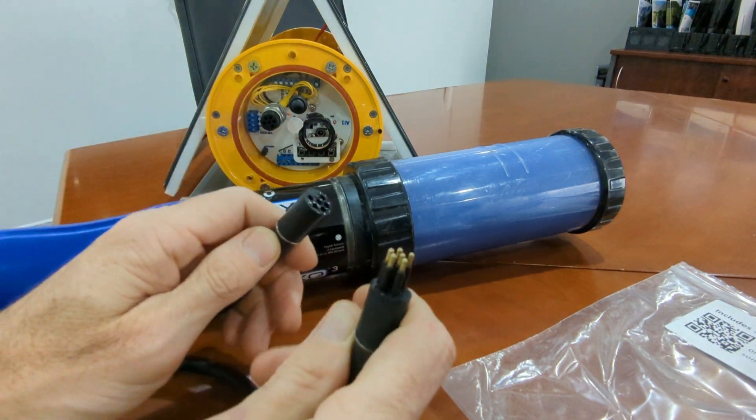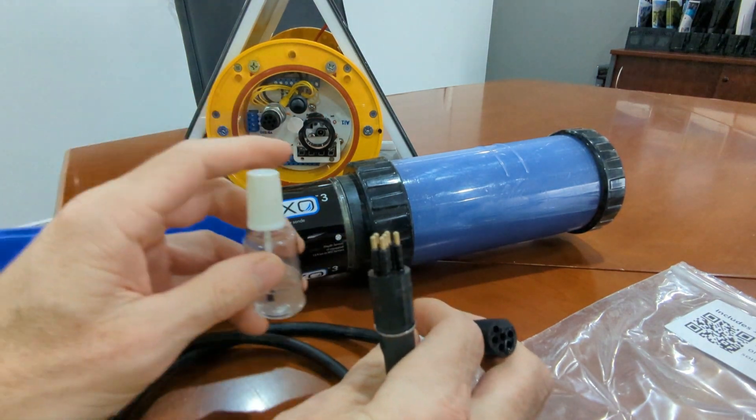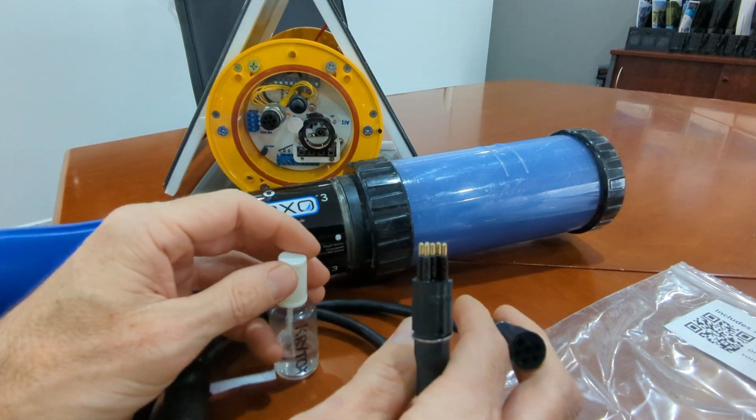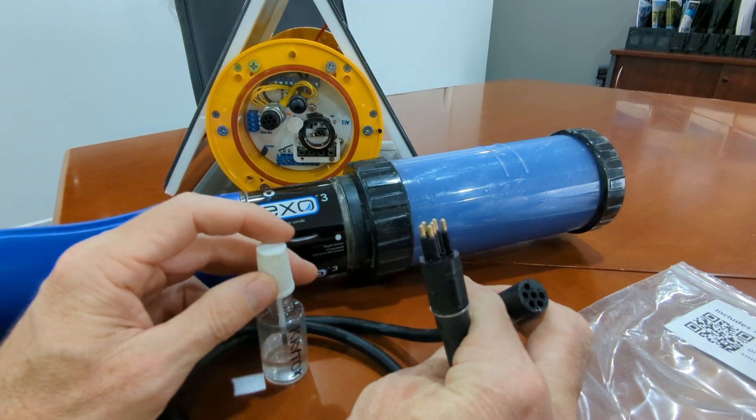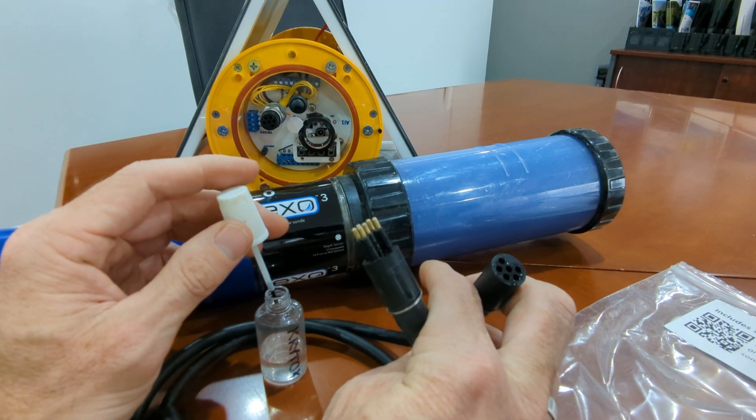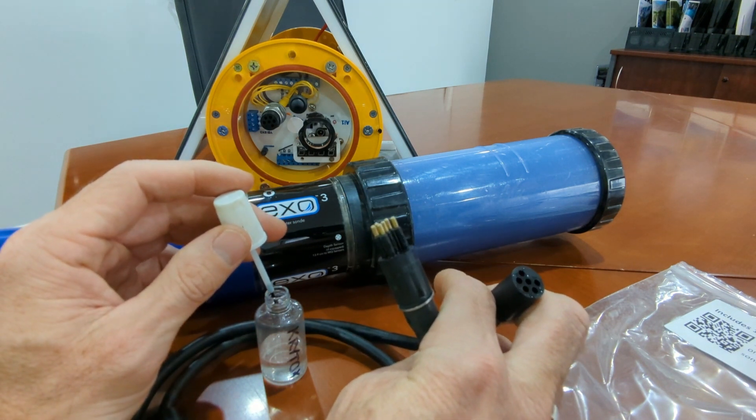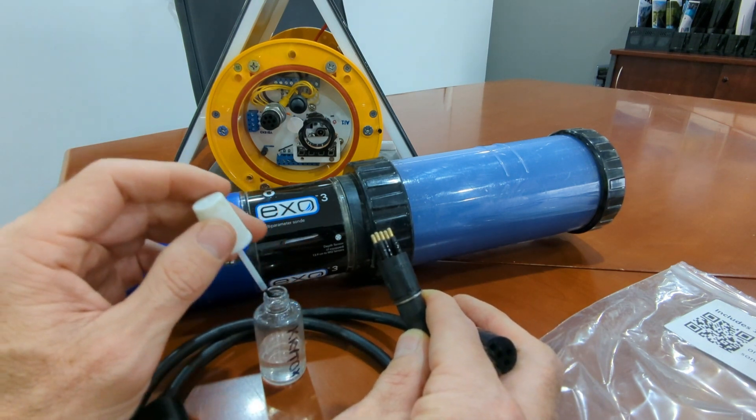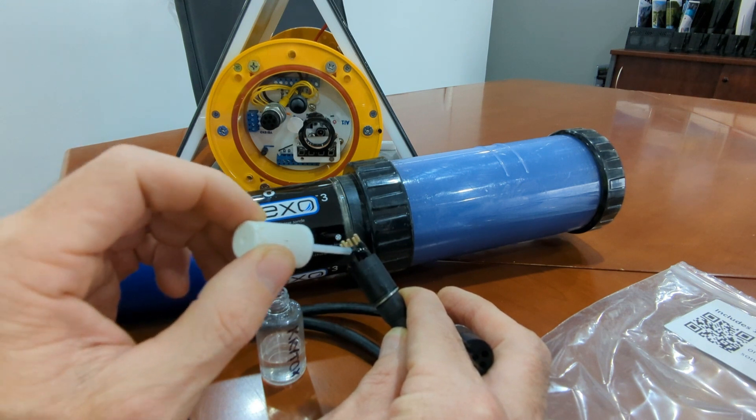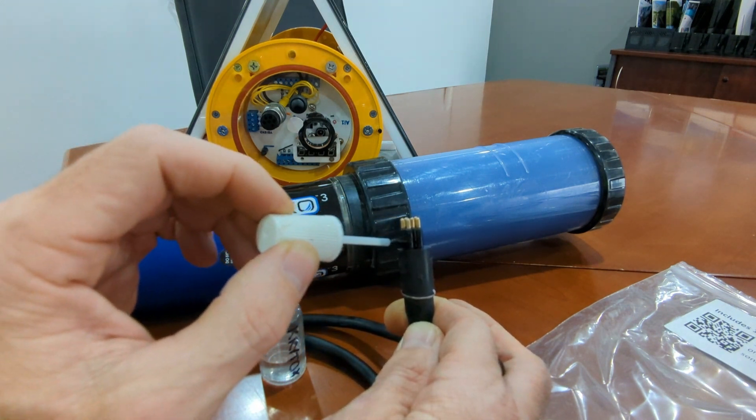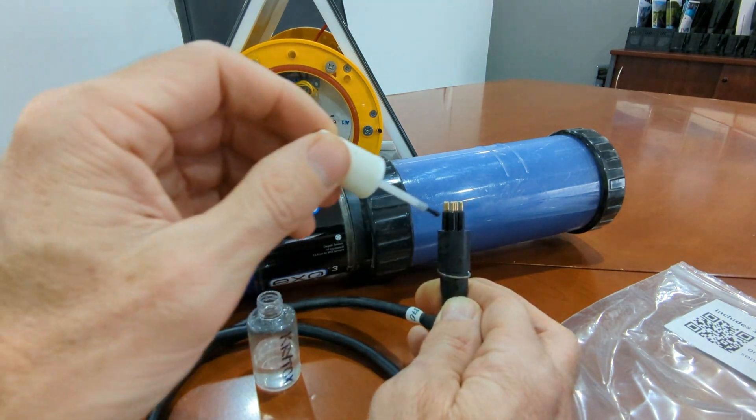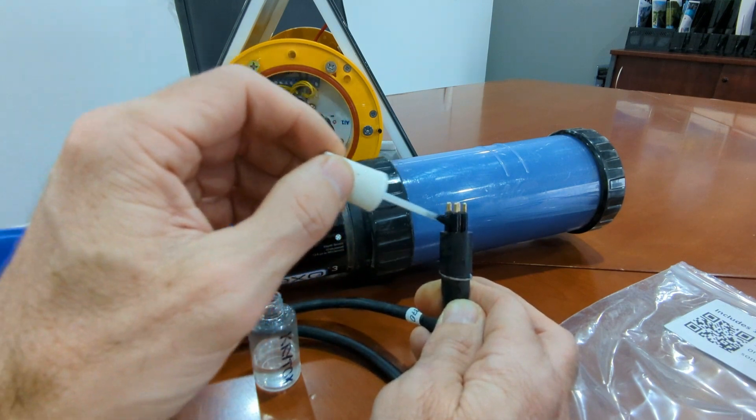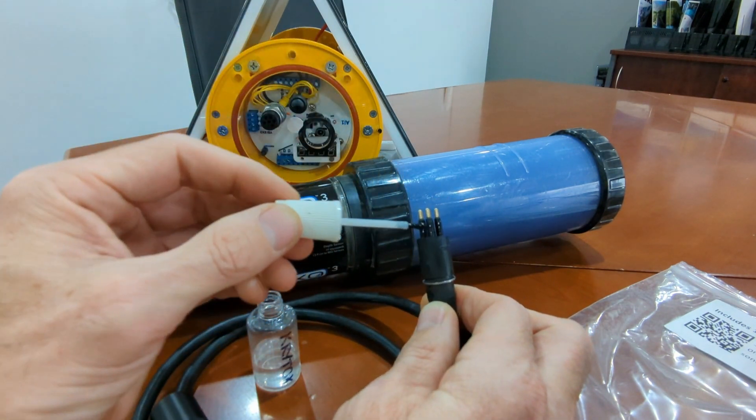To prepare the cable, we use Krytox grease. I've got mine in an easy-to-dispense nail polish jar, but you may have it in another form. The Krytox grease is often supplied with the sonde materials. Apply the grease to the rubber parts of the male part of the connector, making sure there's enough that most of the surfaces are covered and that the rubber is lubricated so it slides in and out nicely.